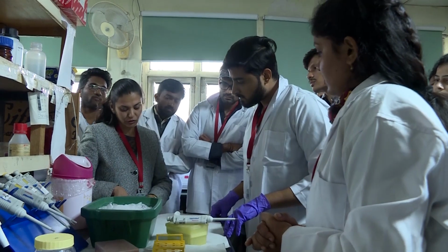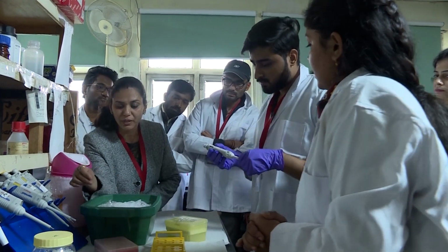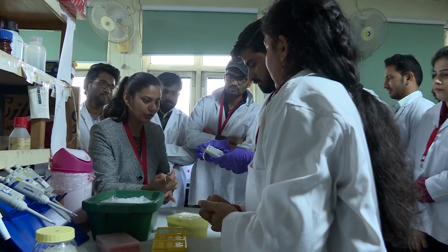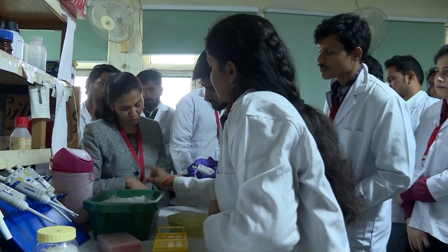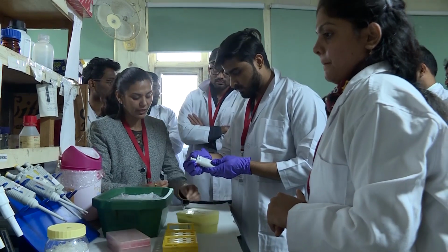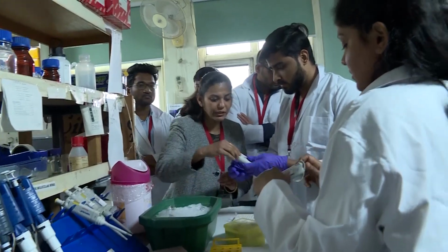Okay, so you have to add 1.6 microliter of forward primer. This is forward primer, actin. So add 1.6 microliter of this actin in both the tubes. So 0.8 will be there, no? 0.8 of forward, 0.8 of the total. Which pipette are you using? So 0.8 microliter of forward primer in both the tubes. Be careful while taking 0.8.